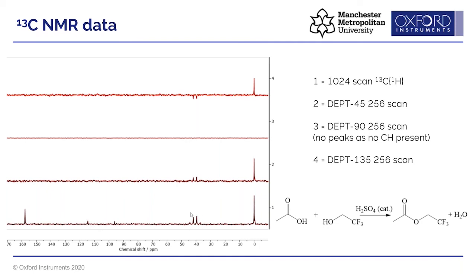We've then got the CH2 at 40 ppm that is next to CF3, and that shows up as a quartet because we see the splitting from the three fluorine atoms within two bonds of it. And lastly, we've got the methyl group of acetic acid, which is here at about 0 ppm. Again, don't worry too much about the chemical shift, it's just a kind of arbitrary scale. I'm not saying that's exactly where the peaks will be, but they're used as something to infer what is going on.